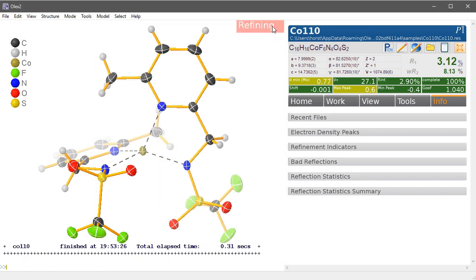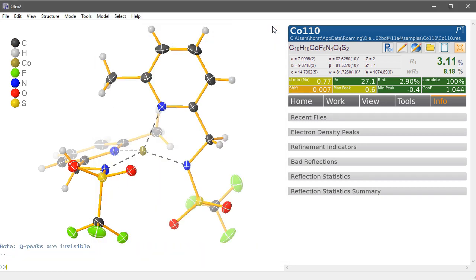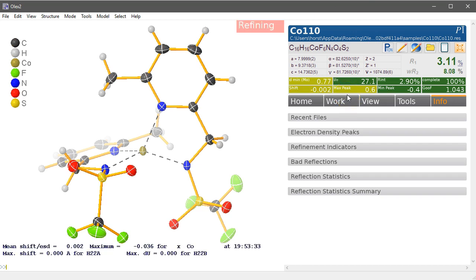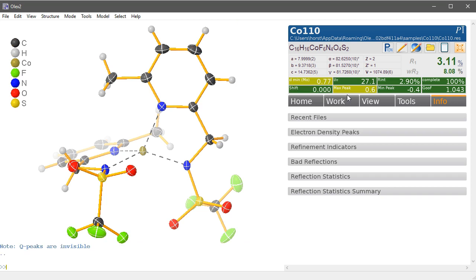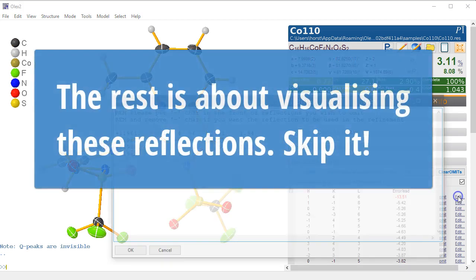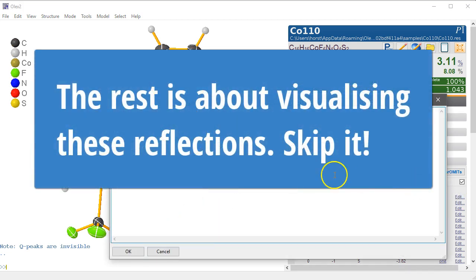So if we refine this now, we have a slightly lower r factor. We haven't omitted the whole reflection, but we have kept reflection in but omitted the one offending part. But the odd thing is here, if you now actually look at the bad reflections, it's actually back and it's worse than before. I'm not entirely sure what that means.